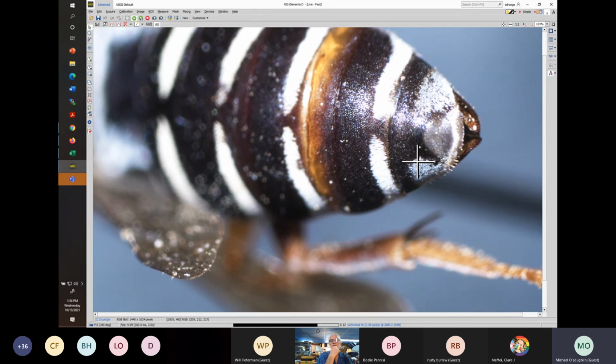Oh, I think here we see the sign of Epeolus better, but here's a pseudopygidial area. It does look different in some ways from both Triepeolus and Epeolus in terms of the silvery stuff, which is quite unique to lectoides, I believe. But this distance is about equal to that distance, which is more in the Triepeolus camp.